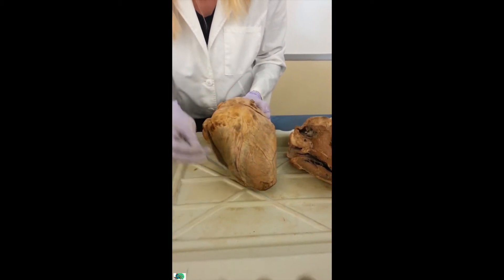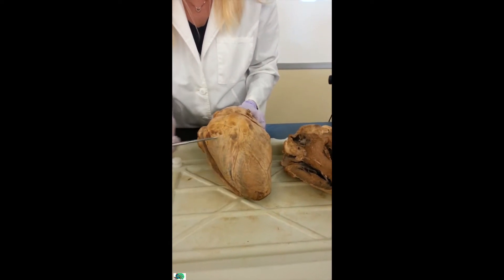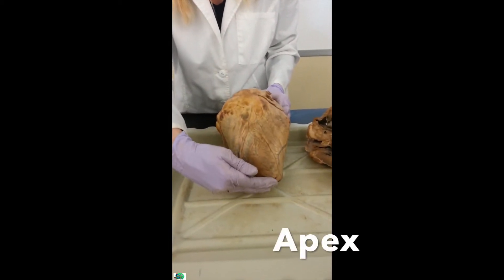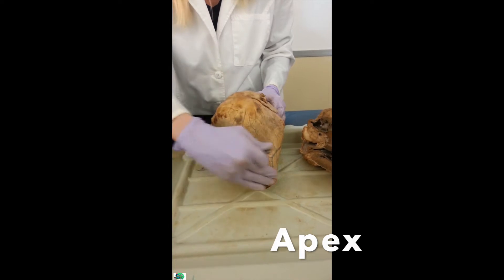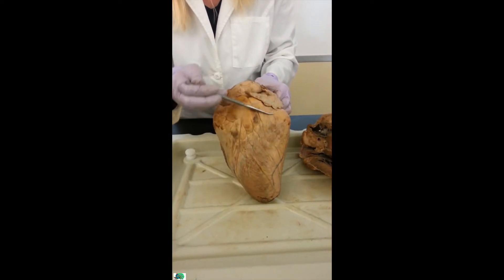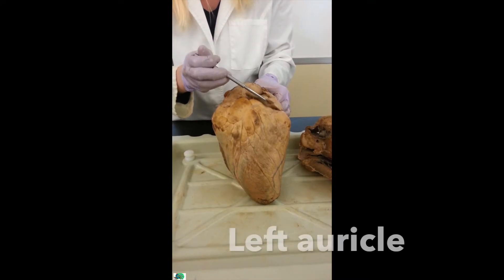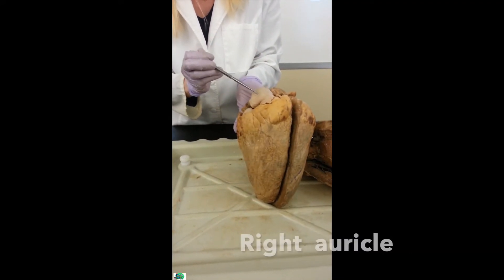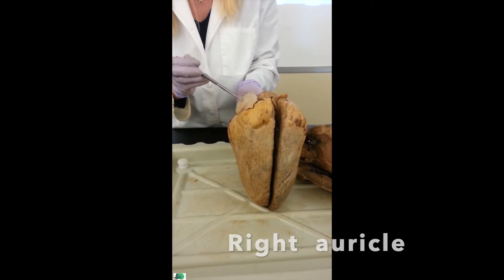I know this is the left side because it's huge compared to the right. The tip of the heart right here is called the apex, and it's made up of the left ventricle, so it has to be the left side. Following that, this is the left auricle, which makes this the right auricle. They sit on top of the atria and increase the volume.